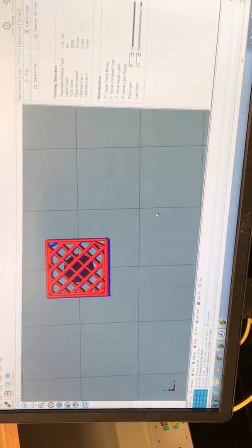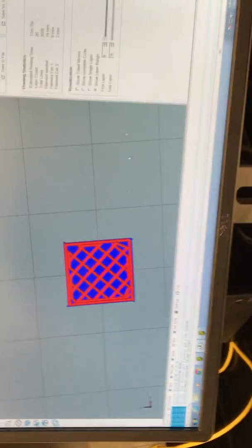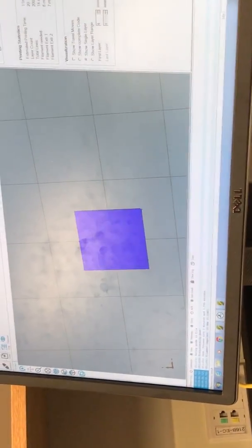Now, Hector, I have a question. Do we have any live observation of the printing? So just change it for the bottom one. Let's see. Give me 1 sec. It looks like it got much closer together. Show single layer.